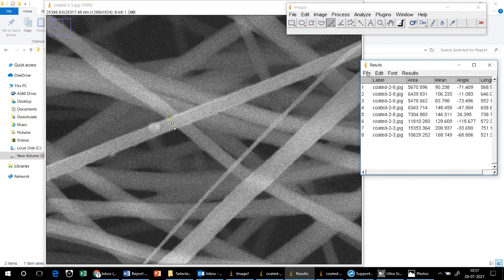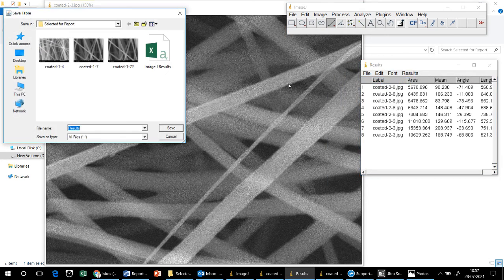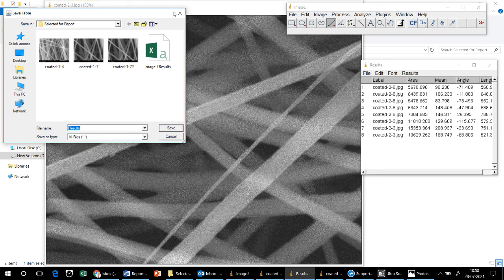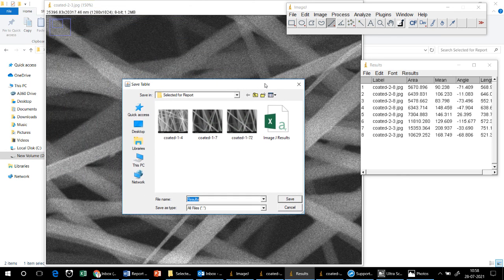After measuring, you can save this file. One fiber measured is 252 nanometers. You can save the results file and import it into graphing software like Origin to calculate the average fiber diameter. So in this way you can find out the fiber diameter using ImageJ software. Thank you.